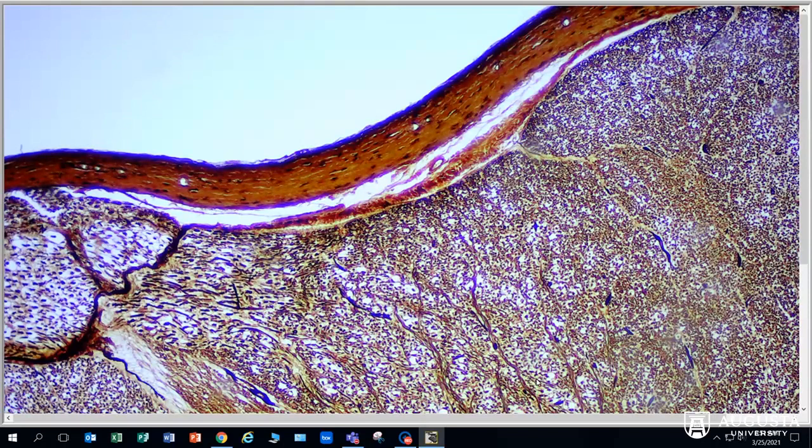There are 3 layers to the meninges. When you're looking at this slide in person, find an area where these layers are teased apart, pulled apart just a little. So here we can see that they've not been pulled apart, but here we see that they have. This allows us to see that middle layer a little bit more clearly.